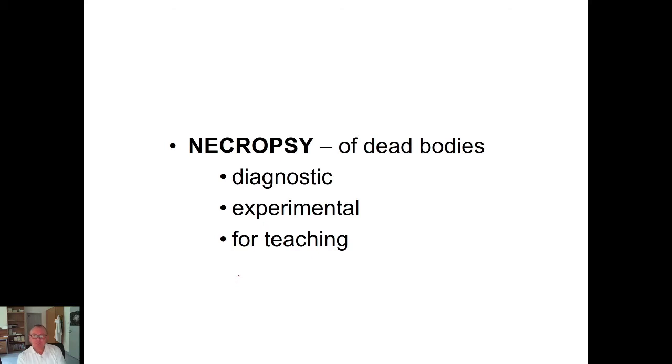Necropsy can also be experimental, from laboratory animals, and necropsy is legal also for teaching. So our slides, which you can find in the boxes in our study rooms, our microscopic rooms, are usually from necropsies which were collected for teaching, because we ask our colleagues in pathological departments for some tissues, organs we need.